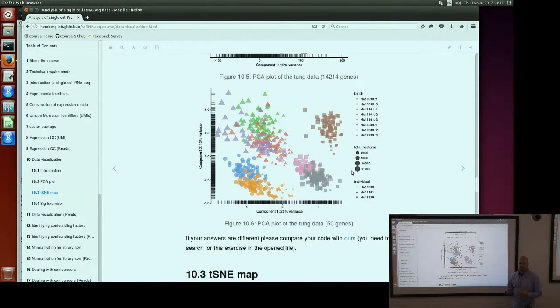Some tools which are integrated with Scater allow you to do that. If your tool is not integrated, then you can take the clustering results, basically cell labels. For each cell, you would have a label saying which cluster it belongs to. Then you can manually save this column to your phenodata information, and visualize it in the PCA by asking for this specific column from your phenodata.